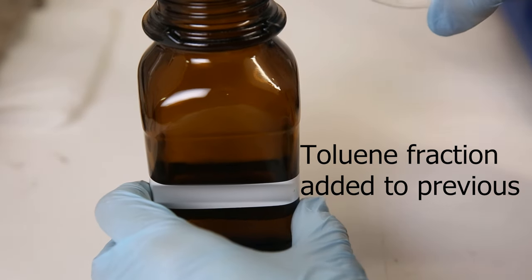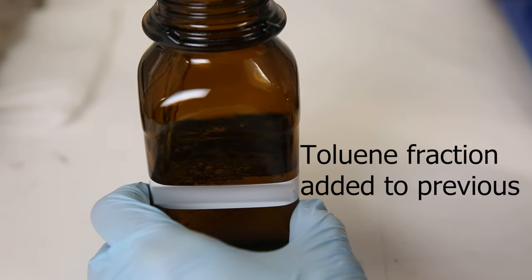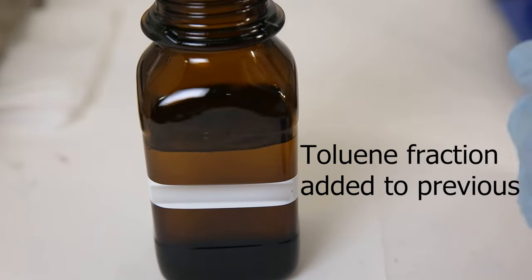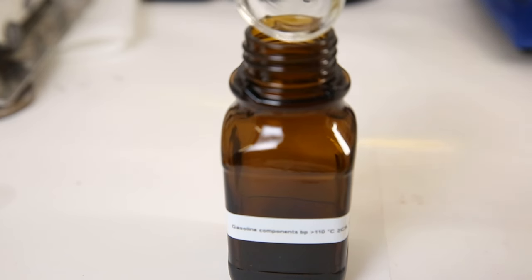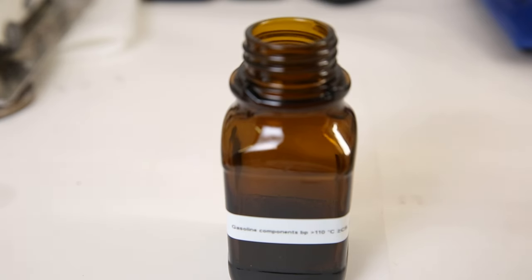Since the last fractions were overlapping somewhat, I decided to put the toluene fraction with the previous fraction, and separate them better by distilling it a second time. I put the liquid that was left behind in the flask in a separate bottle, which should contain high boiling point compounds like xylene, octane, and other hydrocarbons with 8 or more carbons.